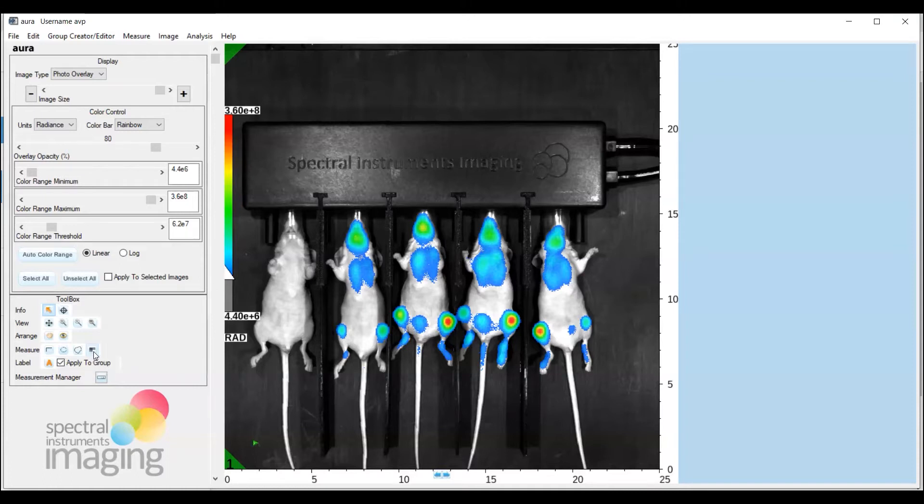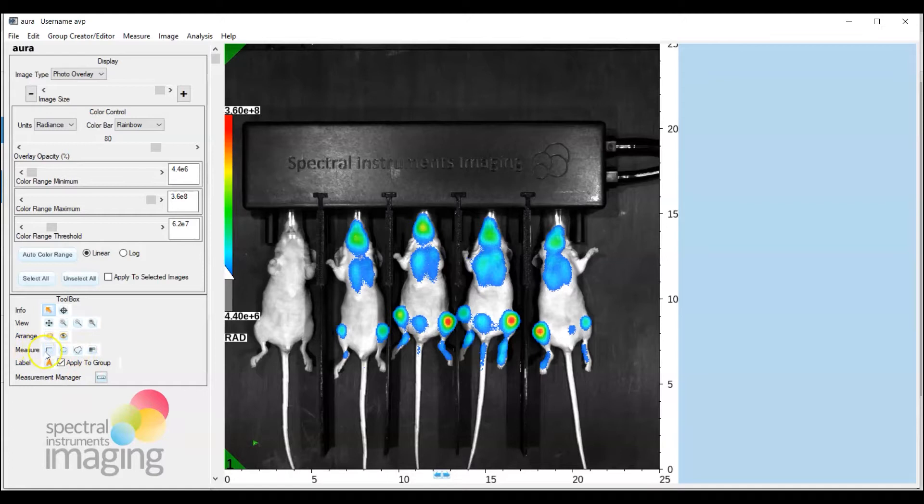So for our purposes here we're going to do the whole mouse ROI and that will be most readily done by going and doing the rectangle ROI.